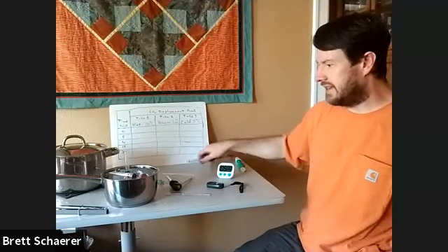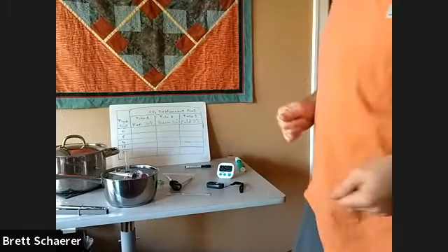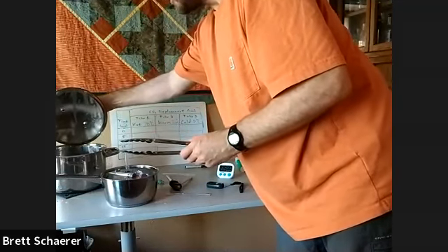All right, so now it is time to start mixing. Let's start with the hot environment. That one's going to be maybe the trickiest. So I'll be extra careful here.